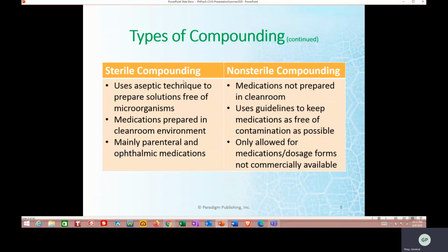if you're using sterile compounding. Sterile compounding has to be free from any kind of contaminants or microorganisms. In order to ensure that, you have to have a specialized, what they call a clean room. The clean room is bacteria free. You have to be fully in the proper garb, meaning you have to have gloves on, you have to have scrubs on, you have to have, I think they call footsies, which you put over your shoes, where you don't bring any germs from the outside. The bonnet, you have to wear that. Some cases you have to wear a face mask, which is popular these days.